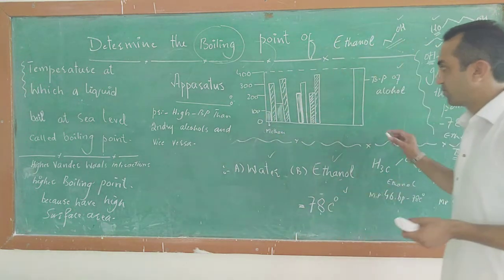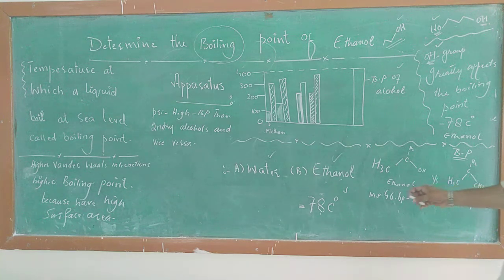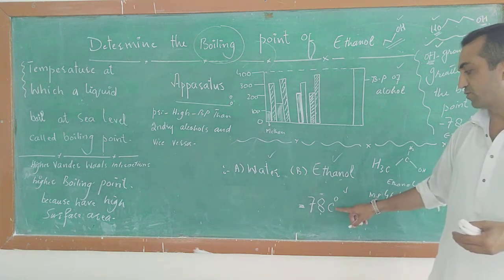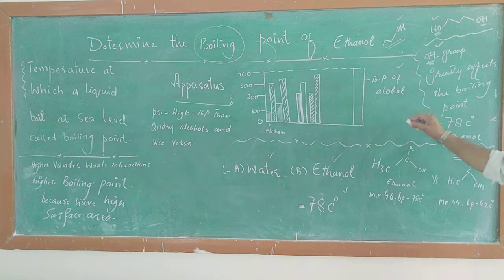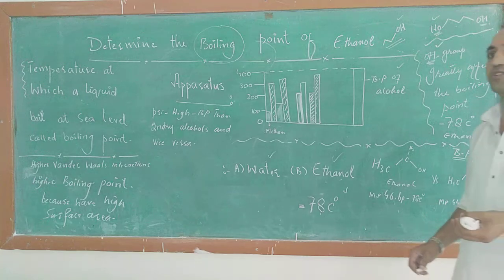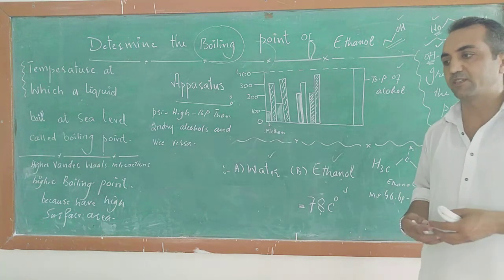In today's experiment we will see in a bit how alcohols boil when we heat them up and the temperature rises to 78 degrees, and then it starts boiling. So the boiling point is the equilibrium point. It is also a signature of any liquid alcohol. You know that these are liquids.